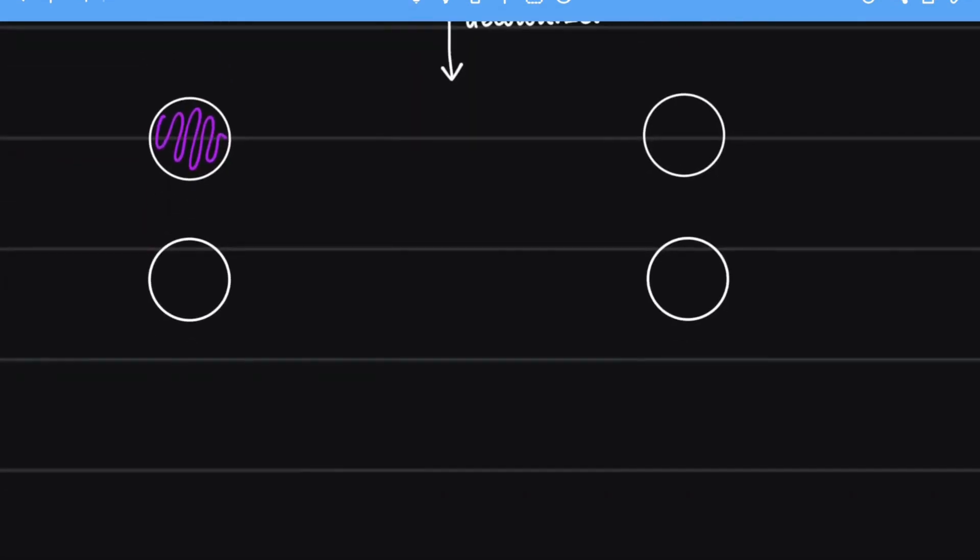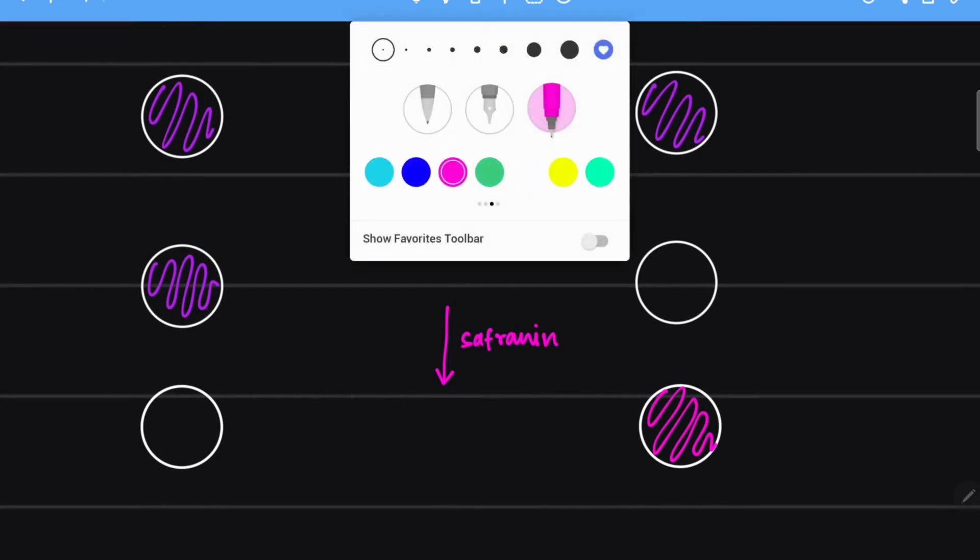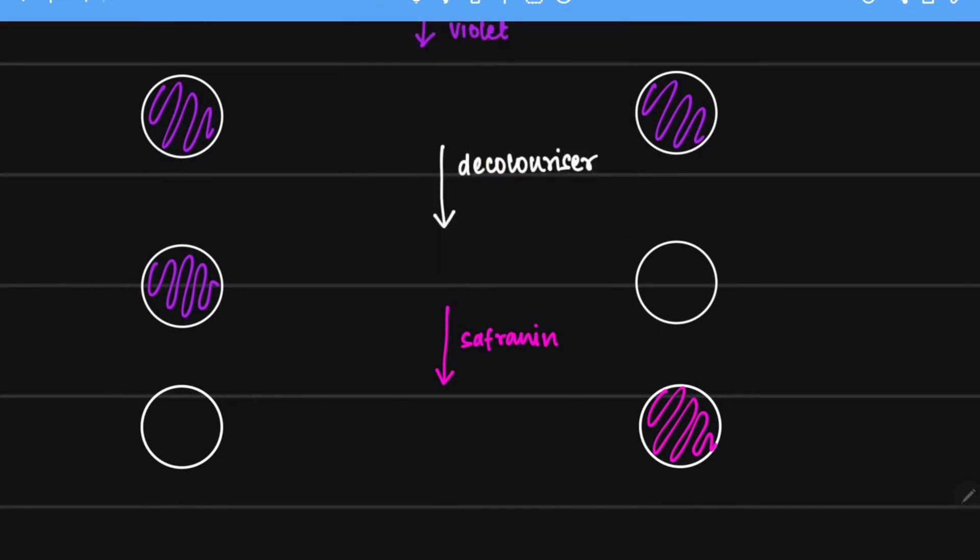Next we add safranin into this. Now once we add safranin in, the decolorized gram negative bacteria will be stained pink. Whereas the gram positive bacteria already has the stain and it retains the stain of being purple.